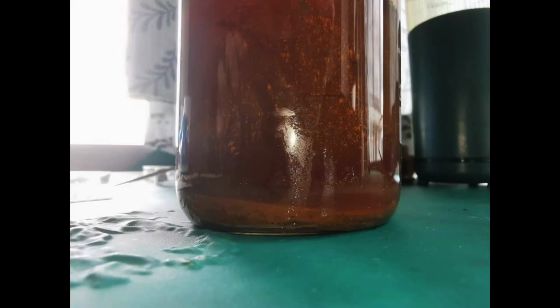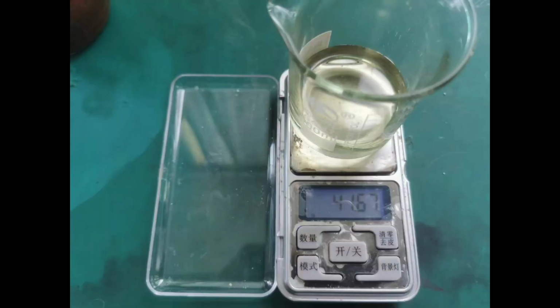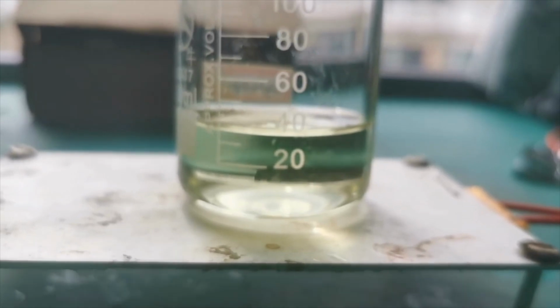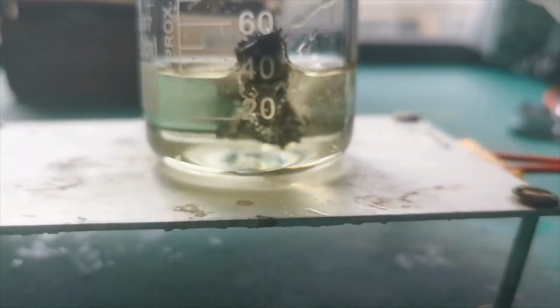It was 2 weeks later that I came back to the forgotten beaker with the acid and the magnet. The magnet did react with the acetic acid solution and lost around 8 grams of its weight in total, but I decided that I'm done with this. I quickly dug out my bottle of hydrochloric acid. It has an unknown concentration, but I assume it's around 20%. I poured out around 40 ml and directly threw the magnet in it.